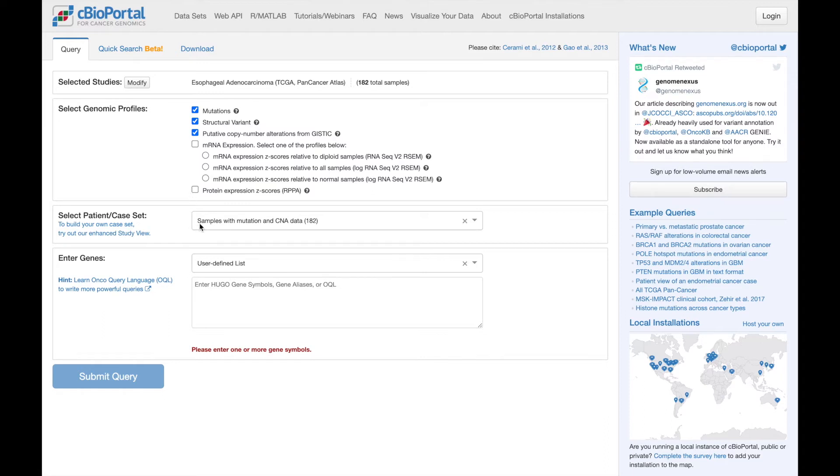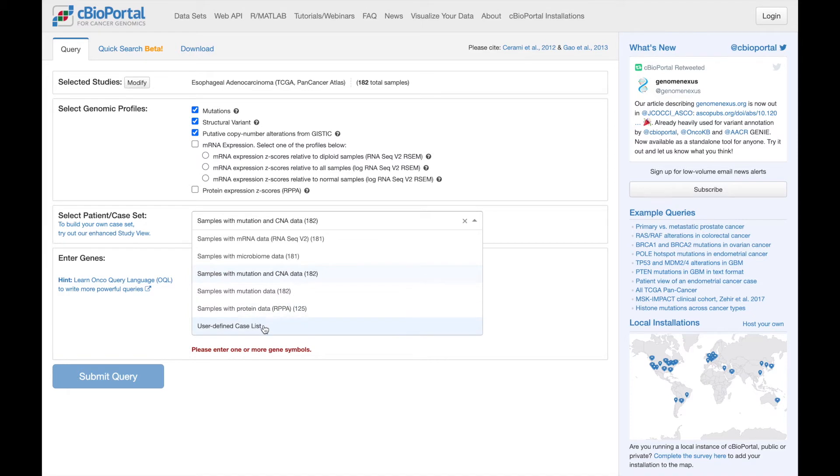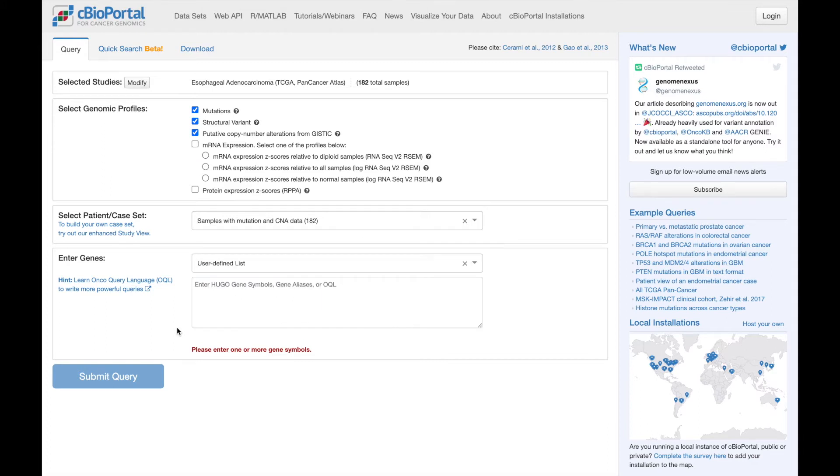Next, select which patients within the study to include in the query. Depending on the study, you'll see some different options here, and I particularly want to mention that there is a user-defined option where you can enter your own list of sample or patient IDs if you've previously identified a subset of interest. For now, I'm going to stick with the default option.